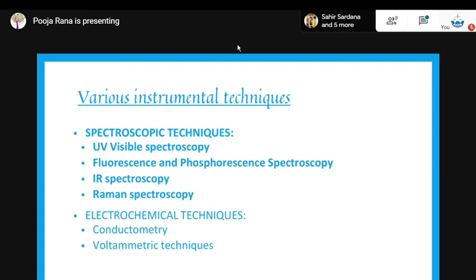All right. Now, next is infrared spectroscopy. It comprises the interaction of matter and infrared radiation. In infrared radiation, the energy of the light wave is not enough to excite an electron and move it to a higher energy level. Instead, the molecule just vibrates. The atom, or even the molecule, vibrates in its own position.